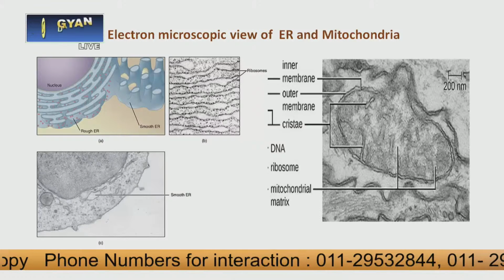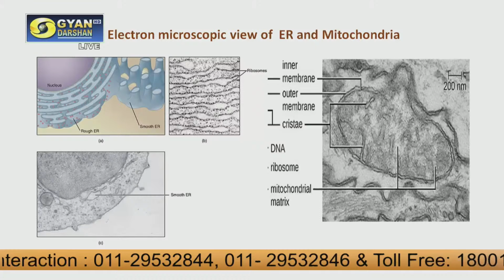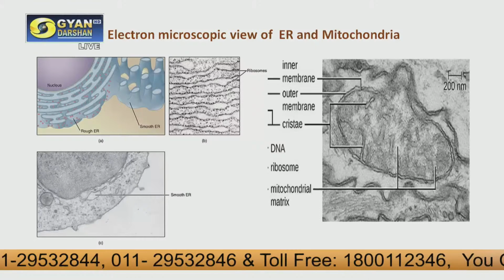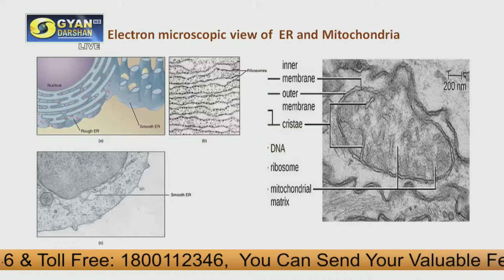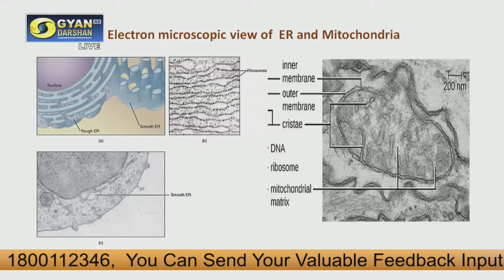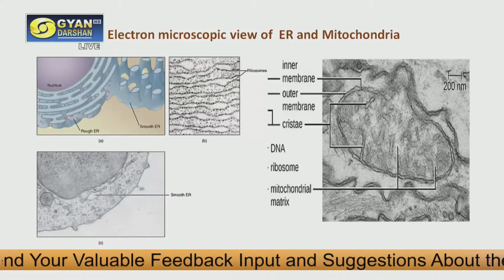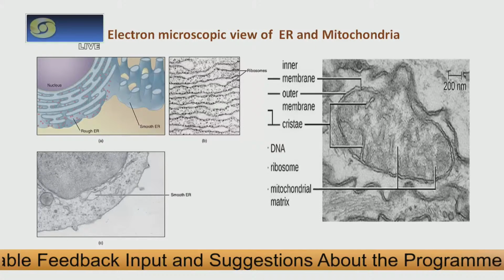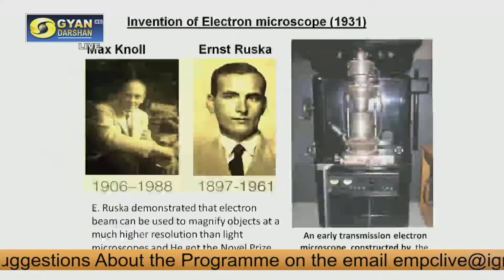These subcellular organelles have specific functions, and we can also observe the different kinds of morphology under the electron microscope. I know you have gone through the structure and function of these subcellular organelles in the cell biology course, while studying this course in BBCT 103.